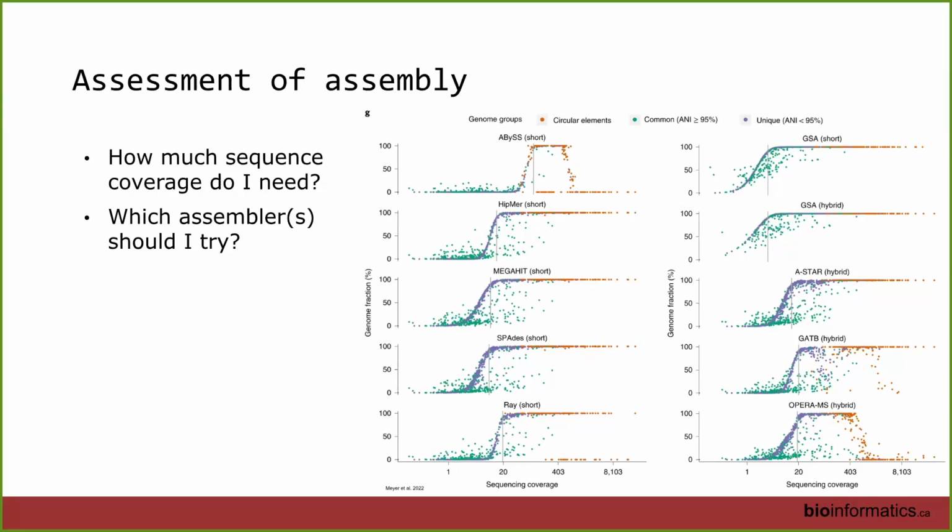And so this has to do with sequencing coverage, because a very common question is, how much sequencing do I actually need to do for my assembler to work on my environment? And so this can help you with that.